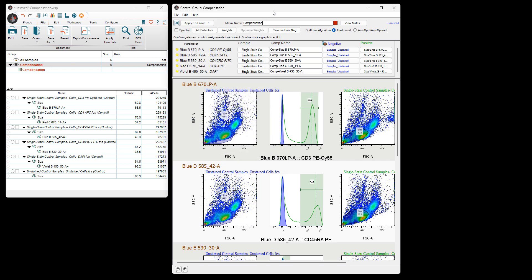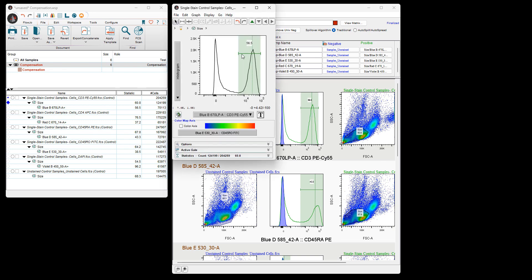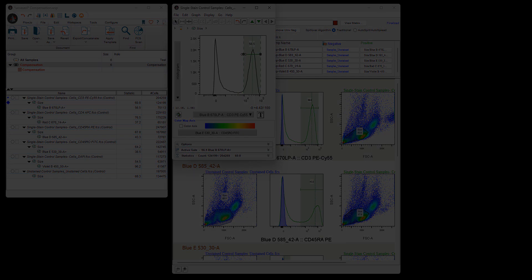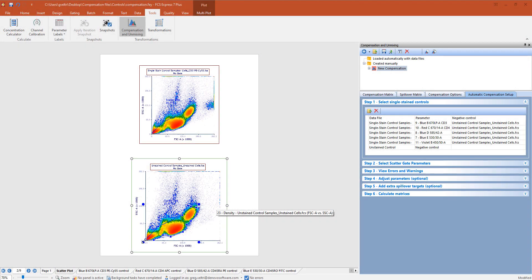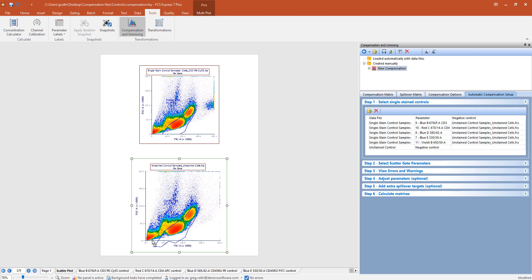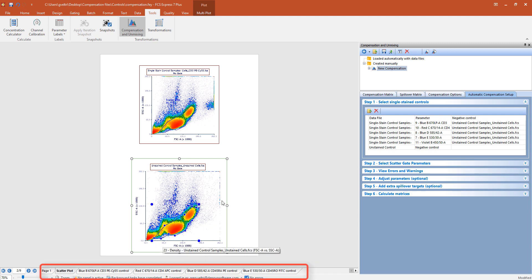In FCS Express, when reviewing plots and gates, you will work in page tabs rather than separate plot windows. Like FlowJo, FCS Express has plots with gates and markers for each single stain and negative control that we will review and adjust, but controls are distributed on separate page tabs, as you can see.